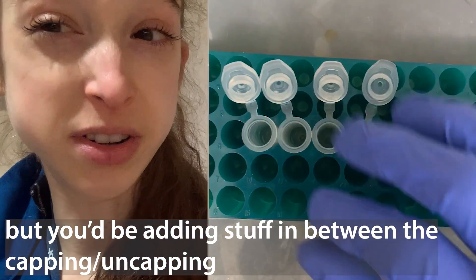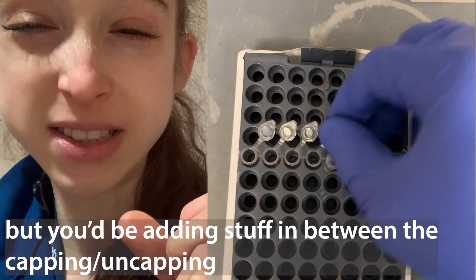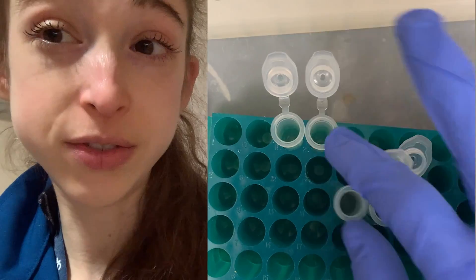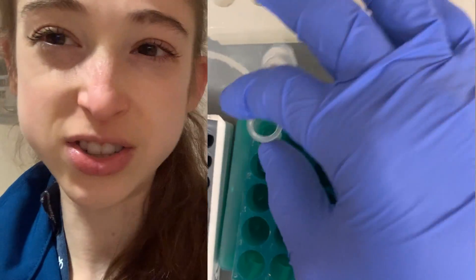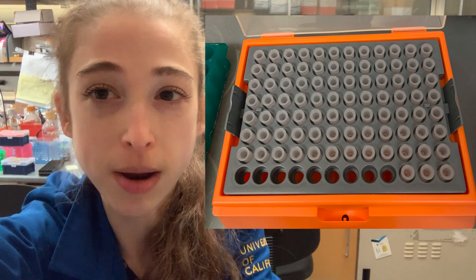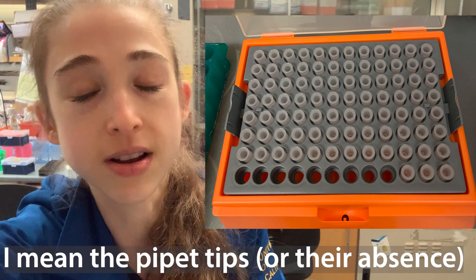This is most an issue when you're dealing with tiny volumes and you can't just easily look at the tube and tell whether you've added something. Another thing you can do is move or shift the tubes up a row in your rack, or to the side column-wise, and just keep track of things that way rather than capping and uncapping. Try to develop a rhythm — one, two, three, four — so you can keep track of where things are. You can also keep track of where your pipettes are in the tubes to know what tube you're on.